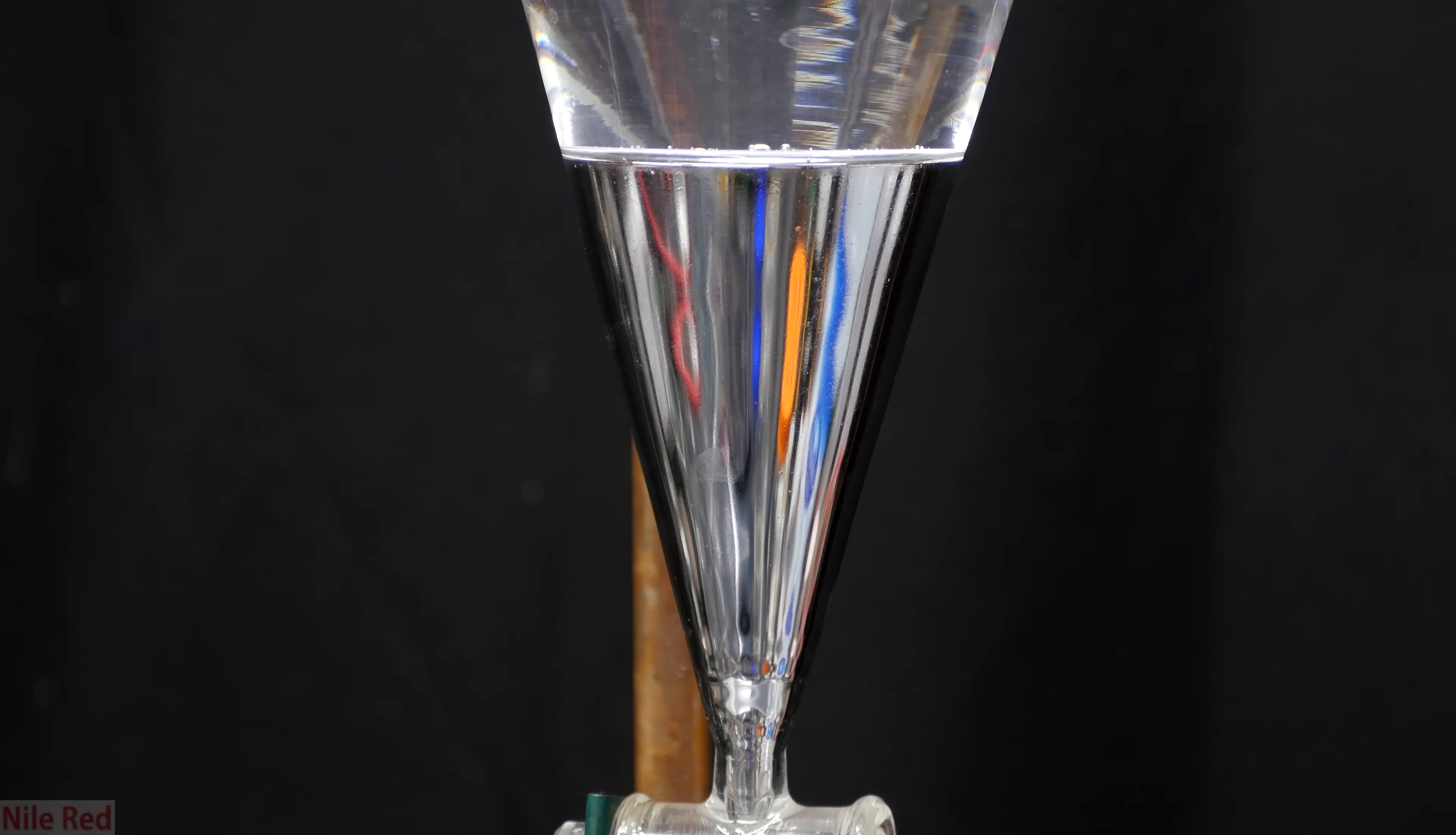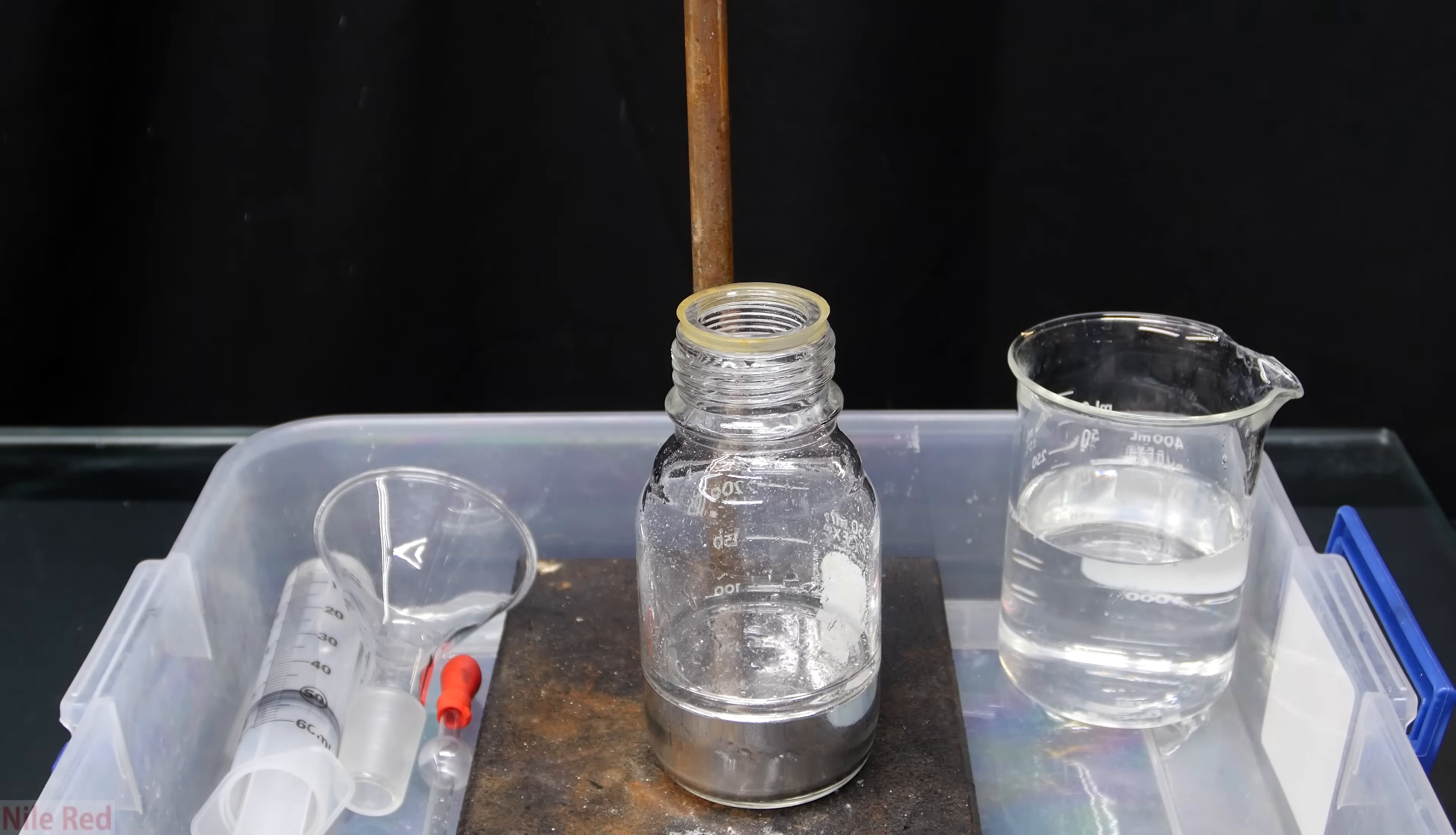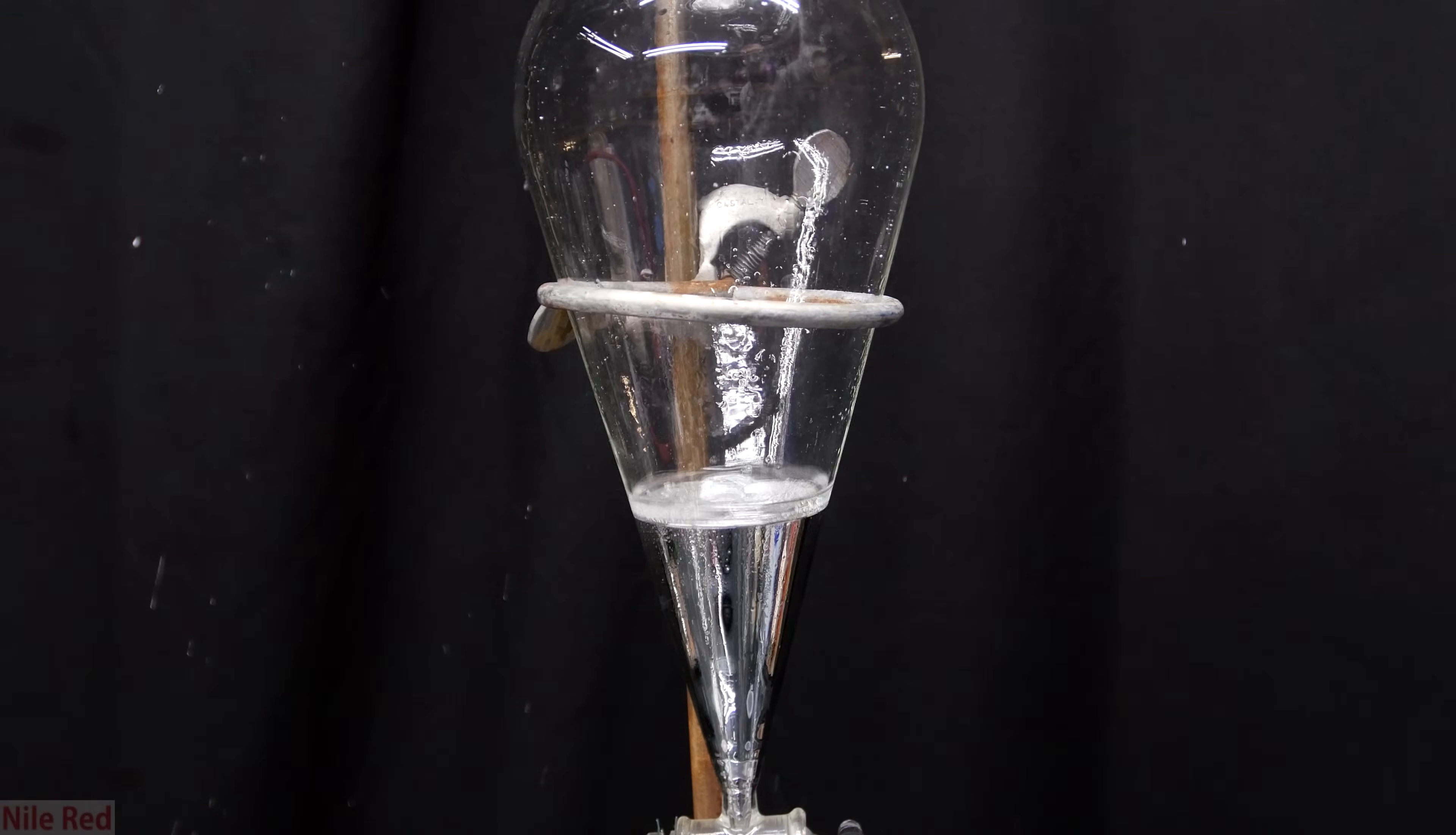After about an hour, it looked a lot cleaner and it didn't really look like there was any oil floating around. The now nearly oil-free mercury was then drained. The sodium hydroxide washing still in the separatory funnel was poured into a waste beaker. The separatory funnel was washed with a little bit of water and then the mercury was poured back into it.